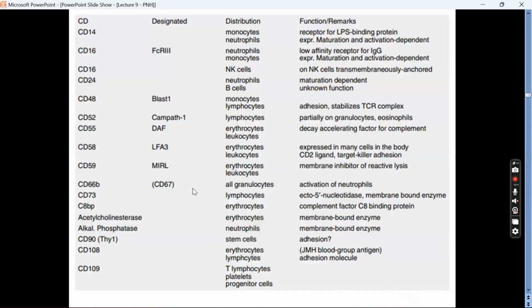Any doubts till now? Any doubts? So far it is clear? Sir, if there is no signal, then it is PNH. If there is no signal, yes, then it is PNH. It is a PNH clone. Okay, sir. Correct now?